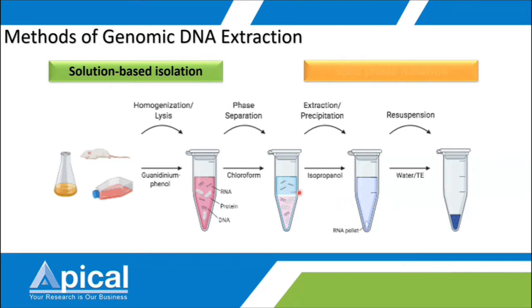Else maybe you will say, I will leave a little bit behind. You can leave a little bit, but for samples that are quite low in DNA amount, the yield of the DNA extracted will be even lower. So that is the advantage and also the drawback of this method.